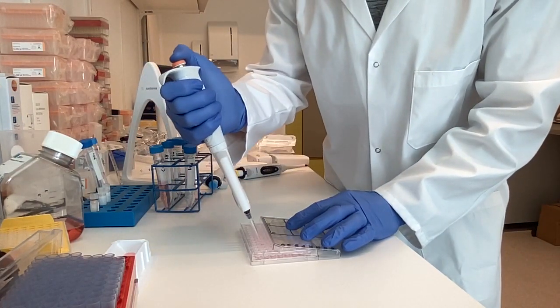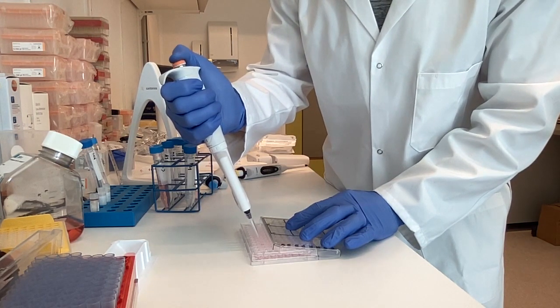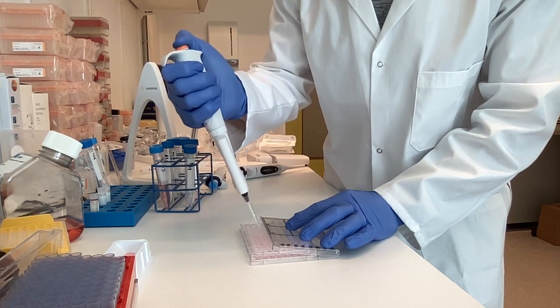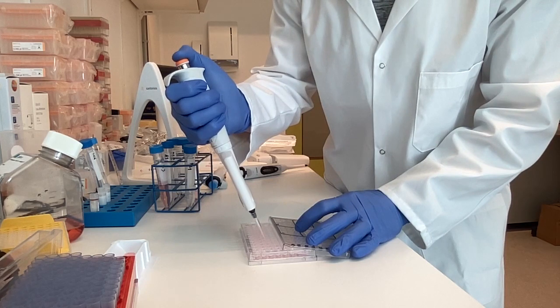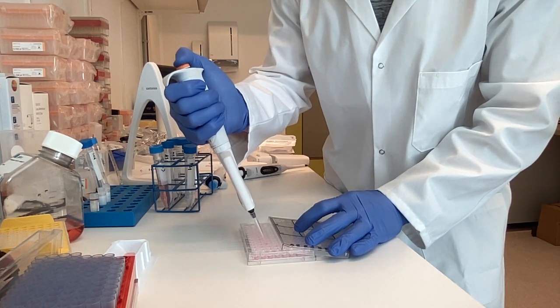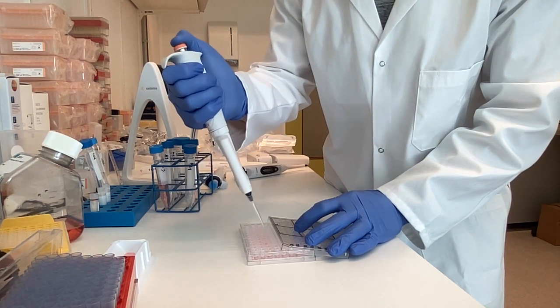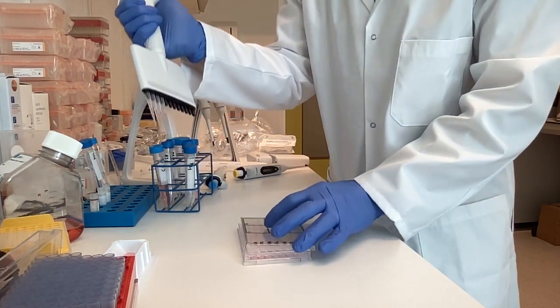Mix carefully, but vigorously, like you've done with the RSE curve. Mix it 10-15 times, completely empty it, take 100, and go to the next dilution, the 3rd dilution from your product. Again mix 10-15 times, completely empty your pipette tips, take 100 and discard.